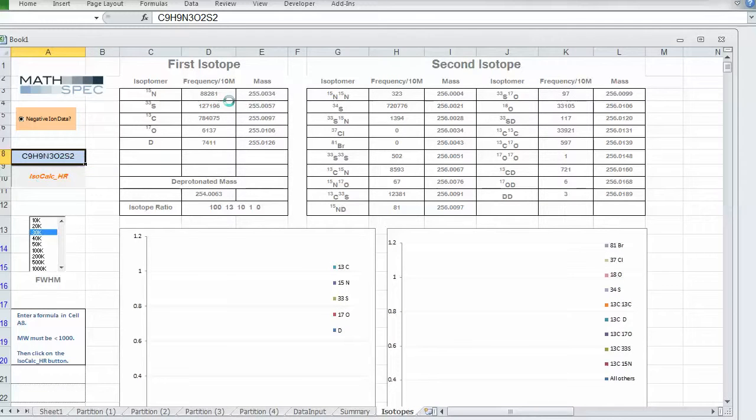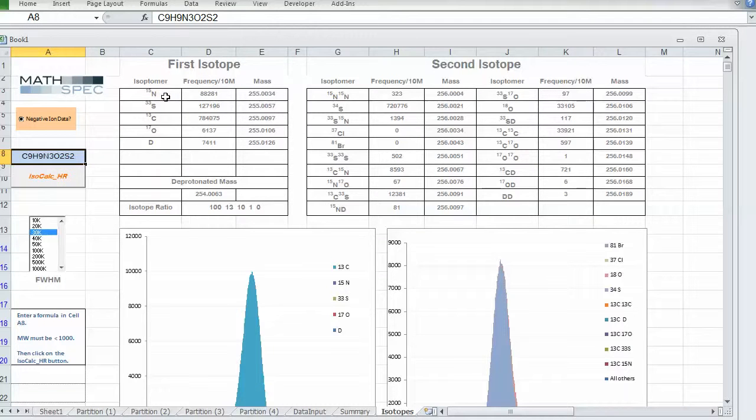Now this will calculate for 10 million molecules how many would be expected to have all the lowest isotope weight with 1 N15 or 1 S33, etc. And for example, there's only 1 out of 10 million molecules that we would expect to have 2 O17s, and the rest have the lower mass isotope.